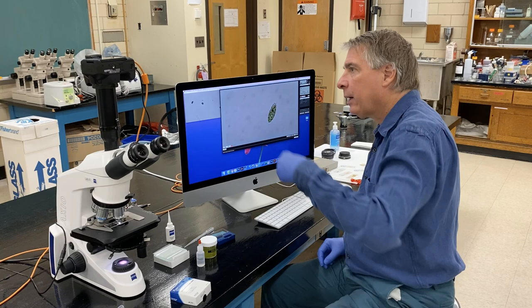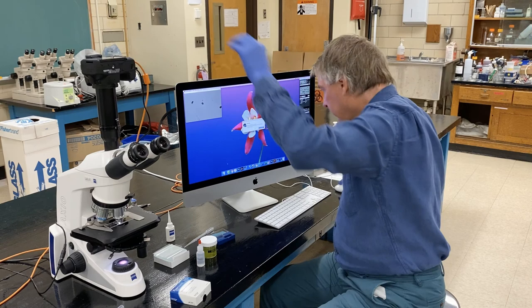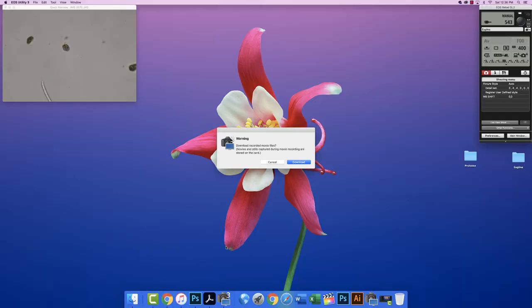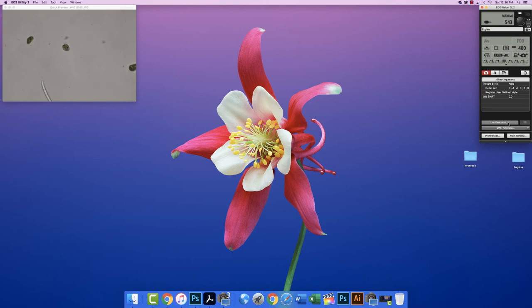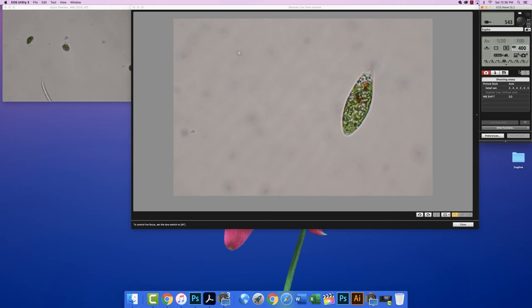Okay, so if we want to get a picture of this, we can turn off the video, and we can go back to still images. Our shutter speed is 1/20, so we have to increase our ISO. Now it's 160, that's not bad. We can take our shot there. He's pretty still.